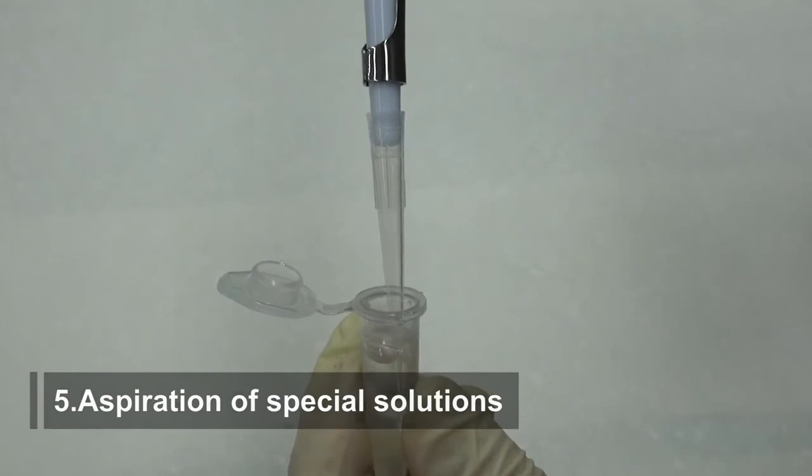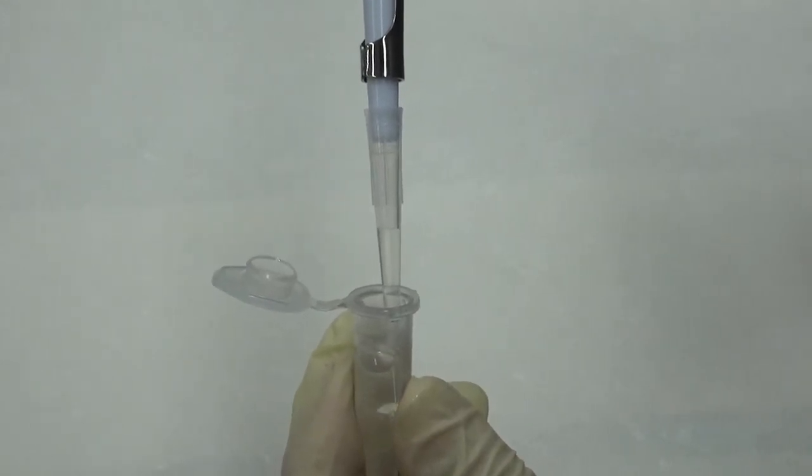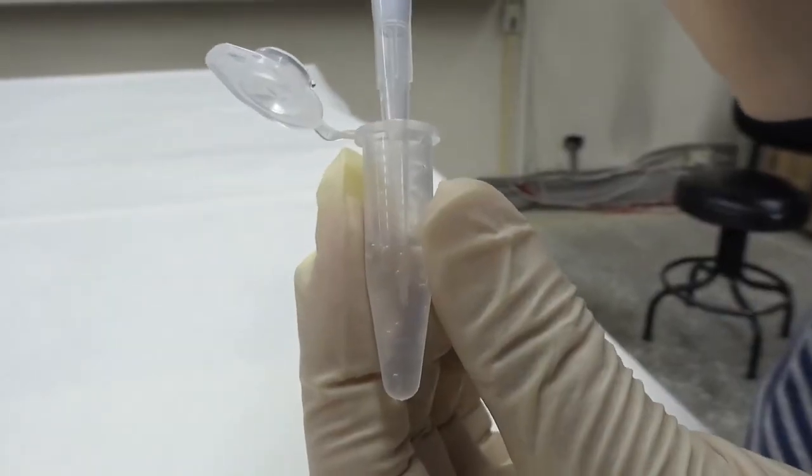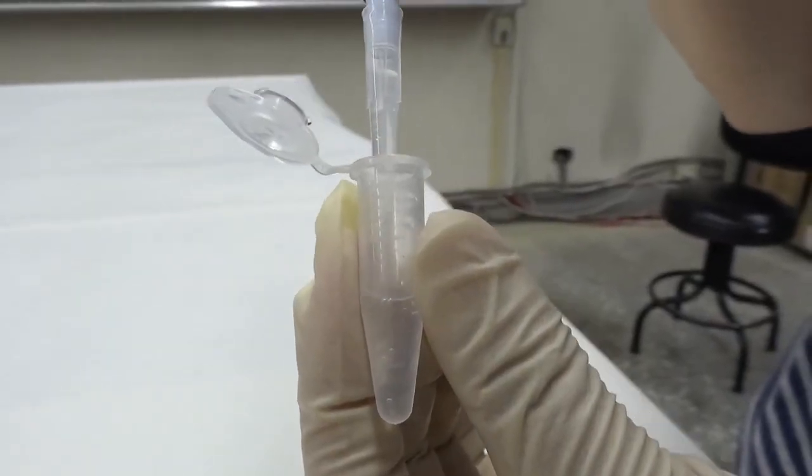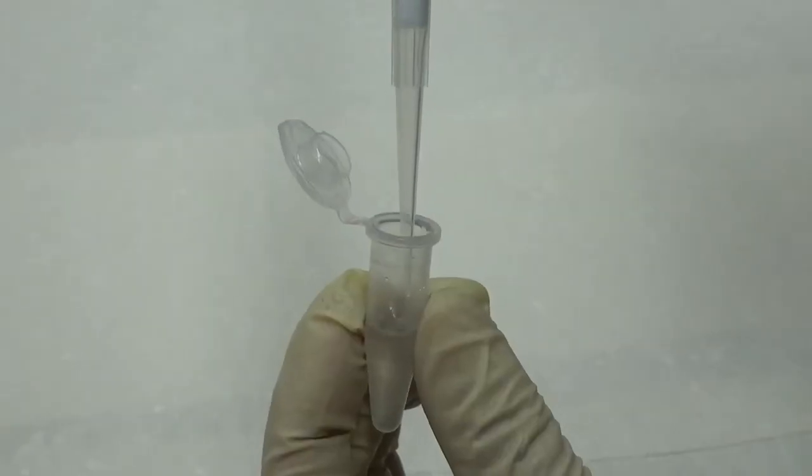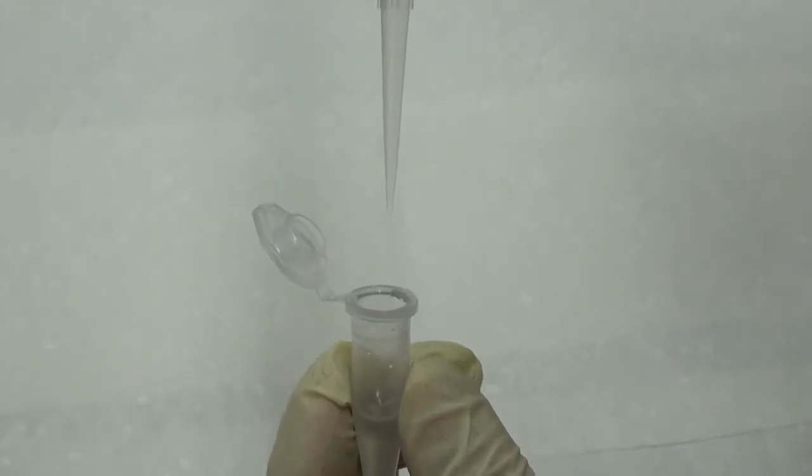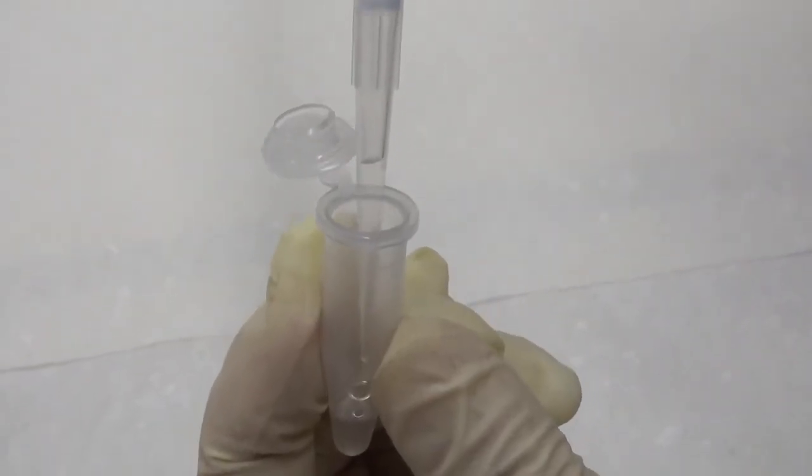Aspiration of special solutions. Solutions with a high viscosity should be aspirated more slowly. Or dilute the solution to a lower concentration before aspirating. Or cut the opening of the tip bigger. Or press the operating button down to the second stop to start aspirating and press only the first stop for dispensing.